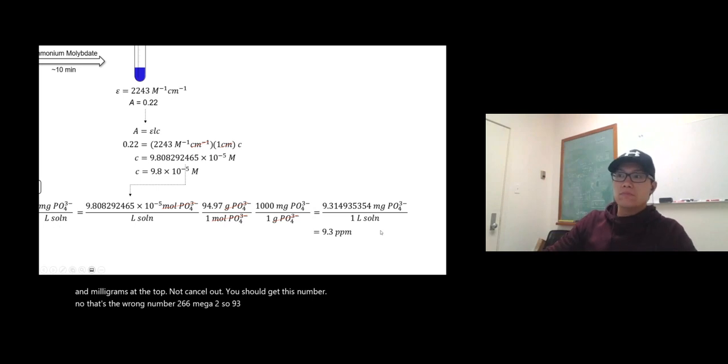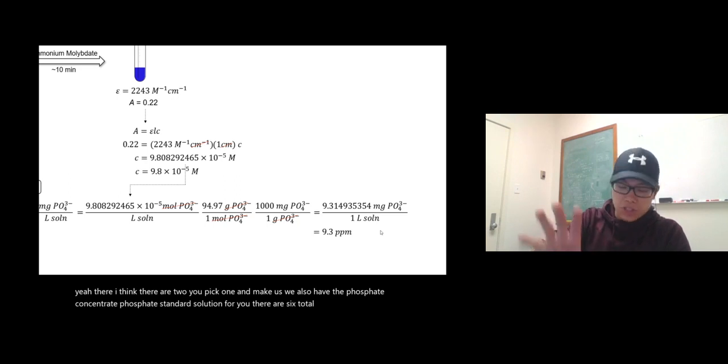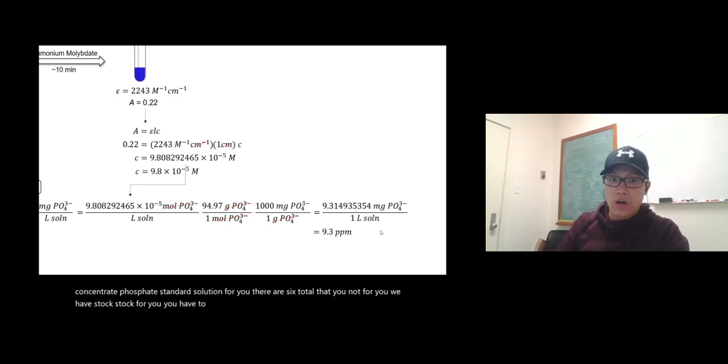Here we go. Right. You're going to do exactly like this in the lab. All right, you're going to have one water sample. Yeah, I think there are 2. You pick one. We also have the phosphate standard solutions for you. There are 6 total. We have a stock for you. You have to do the dilution on it.